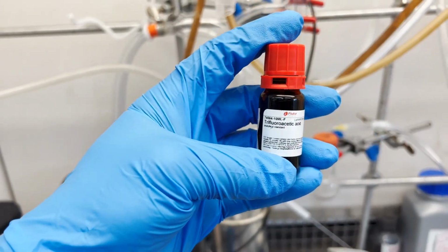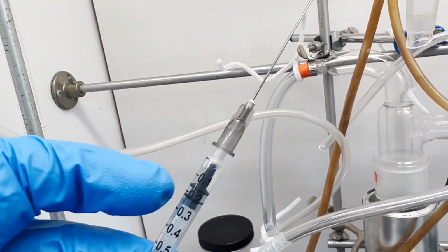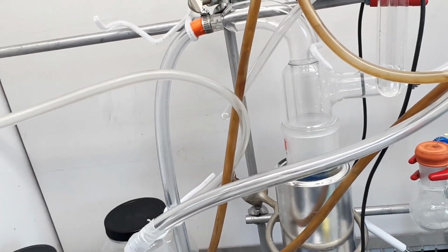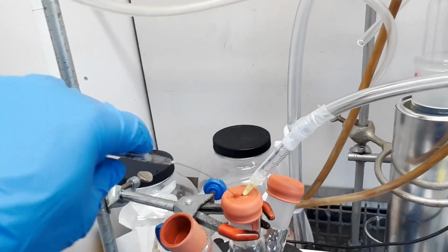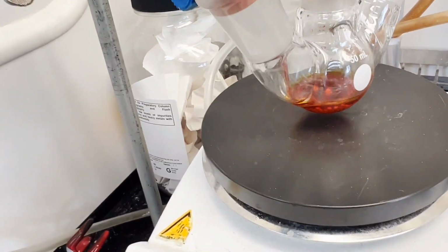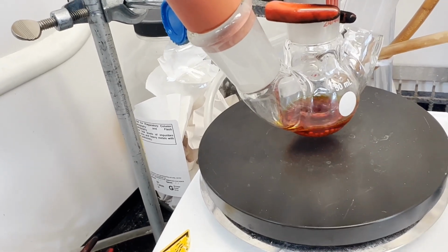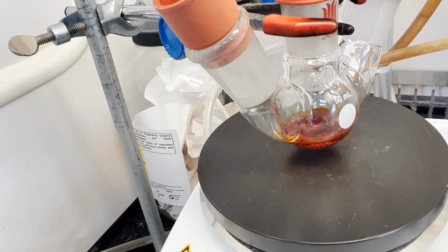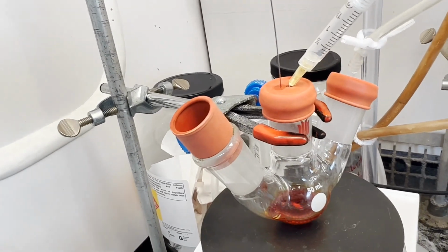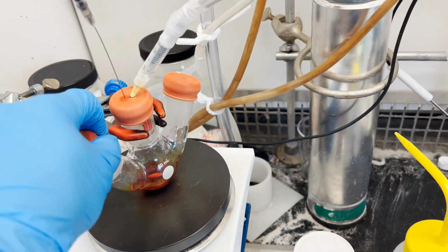So here is the trifluoroacetic acid bottle. I will take about 0.1 milliliter, based on your reaction scale. Actually it is like 0.08 milliliter. So you can do your calculation, and you can go to the literature to see how many equivalents or millimoles they use. I'm using my required amount, and it should be added dropwise, very slowly. Once the addition is done, you can stir your reaction for the desired time according to the literature procedure you are following.